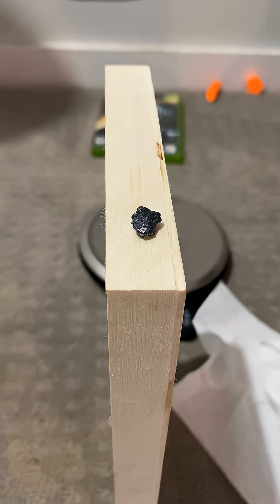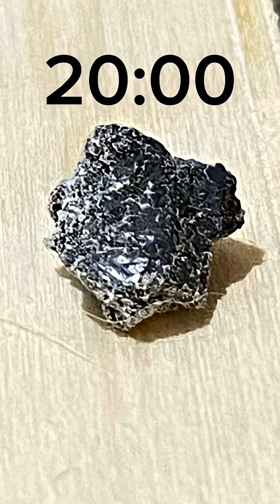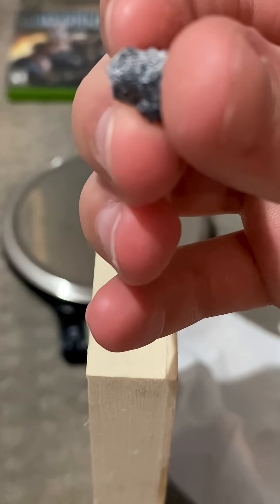Here it is the next day — it's 9:29 in the morning. You can see some minor changes; there's some oxide powder on it. Here it is at 9:17 in the morning and you can see the spot where I cut it is no longer shiny.